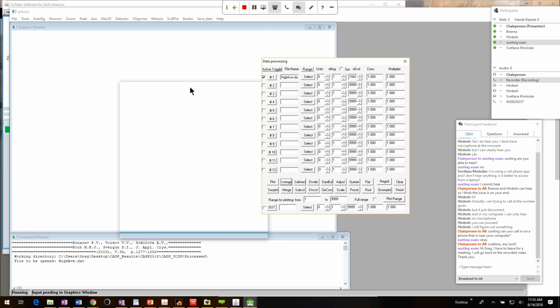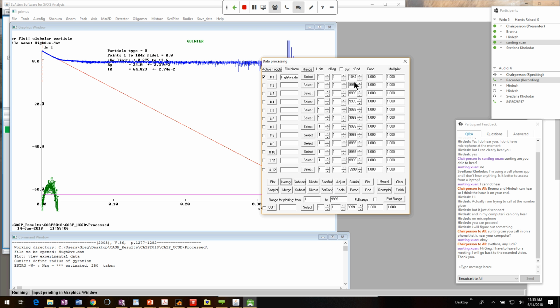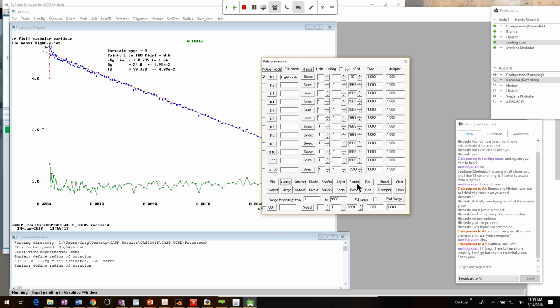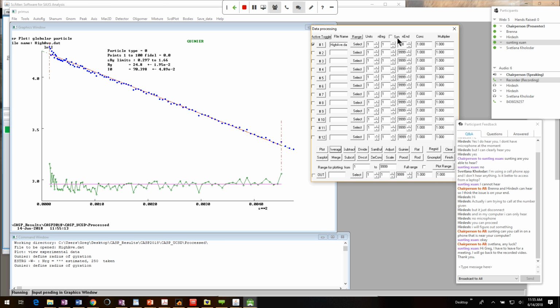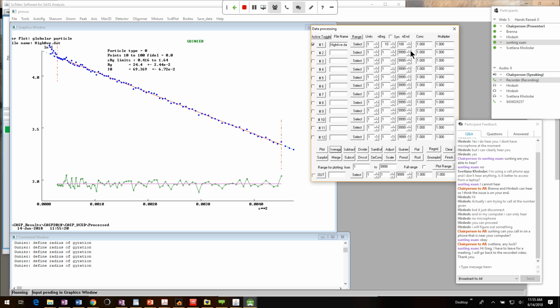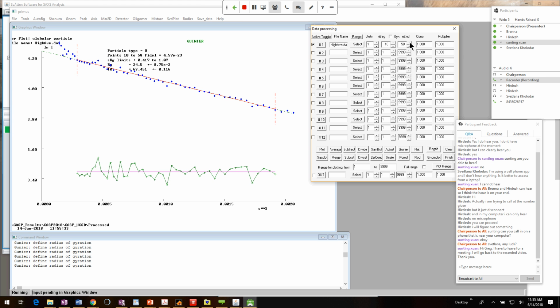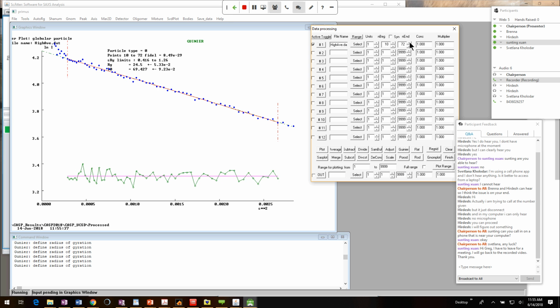Okay, so I've loaded it up. It has 1,000 points. I hit plots. It has this Guinier button here, which does something similar, so I can back that down to 100 and get rid of those first couple points there. And the S times Rg, it's up to 1.64, so I've got to clip that back on the other end, until I have 1.3. Oh, it's too far. Something like that. And the Rg it's giving me here is 24.5. I got 24.6 from Scatter, so they should be somewhat similar.